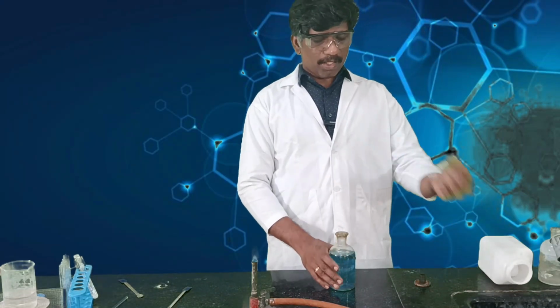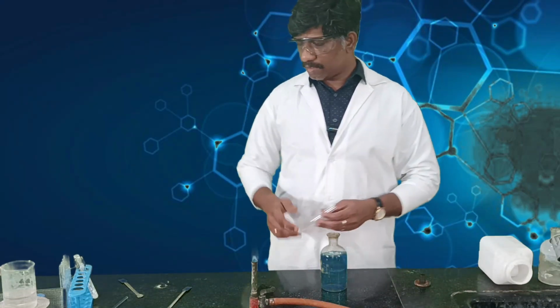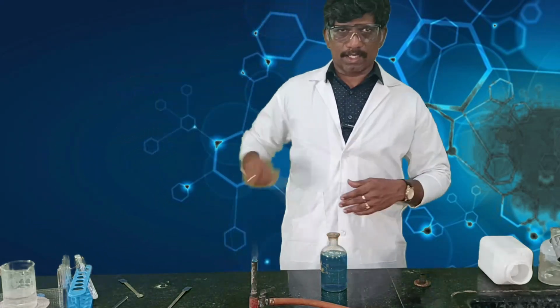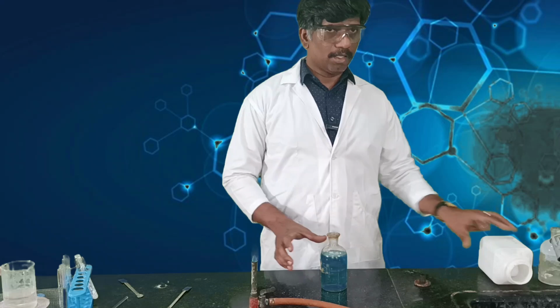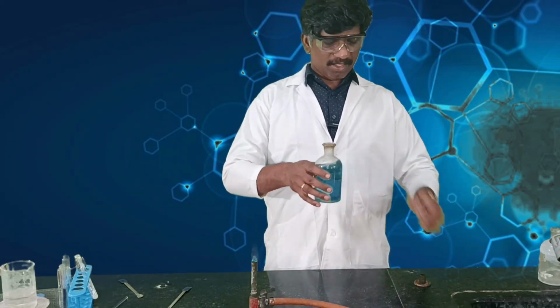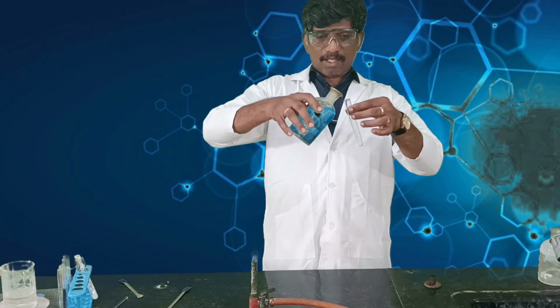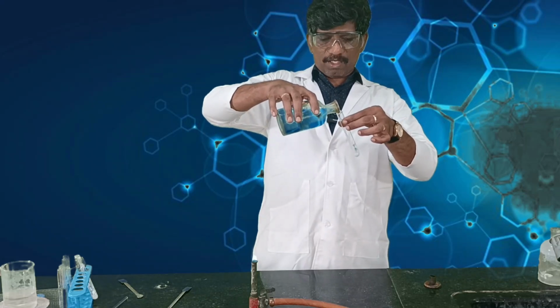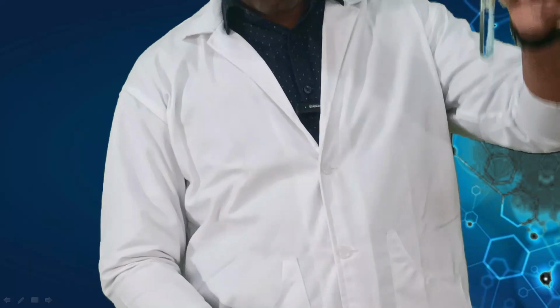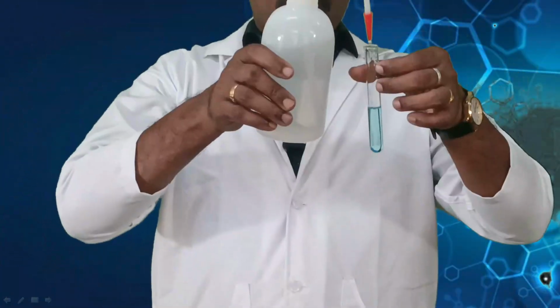A very dilute solution of copper sulfate is needed for this experiment, then only you will get a proper color. Therefore I am taking copper sulfate. It is already dilute, no problem, but I can still dilute this.